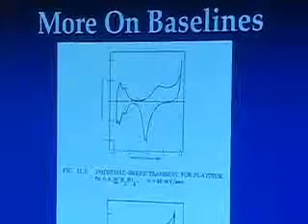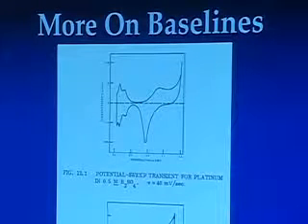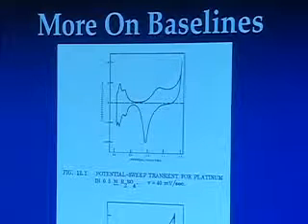So it's very important to have a baseline before you add in your electroactive material. In addition, this is just intrinsic to the system, but sometimes you have some impurity in your solvent or in your supporting electrolyte or whatnot, and gives you a redox active species that you don't intend to be there. And again, you might interpret that as the interesting species if you don't have this baseline.